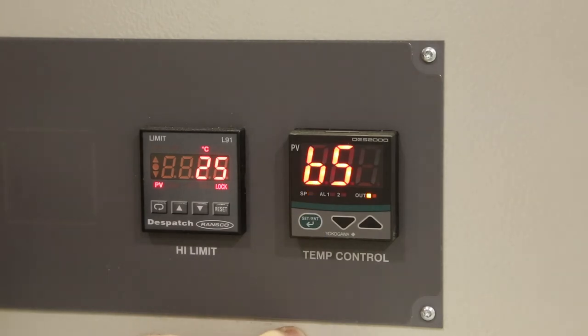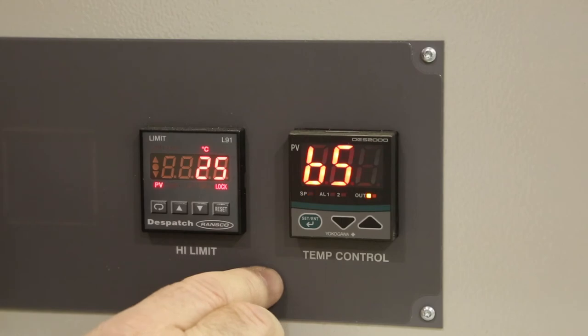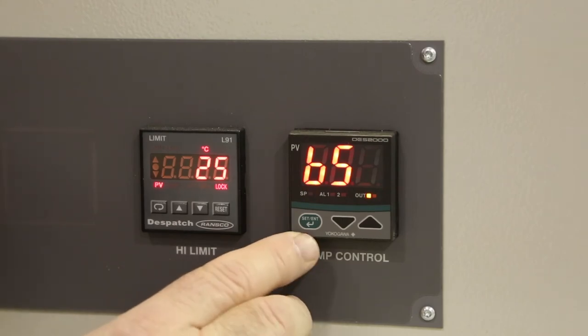Cycle the green button until you see BS, which is bias, where any offset values will be input for calibrating the controller.